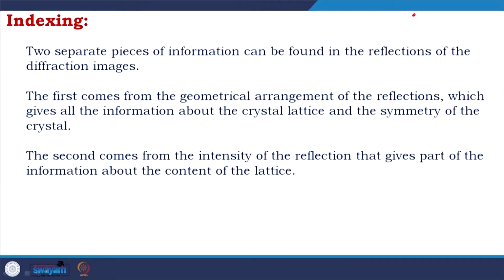So, first, choice of unit cell, and it's critical. Why? Let's take an example. Suppose you have your pattern like this. Now, I choose this, so I most probably choose a cubic type of crystal.